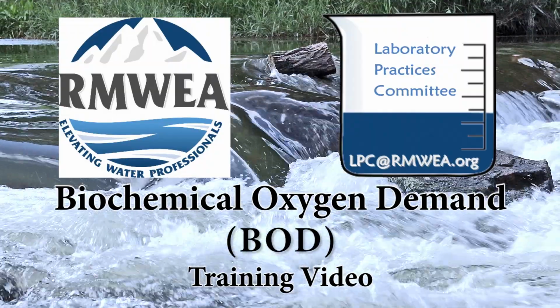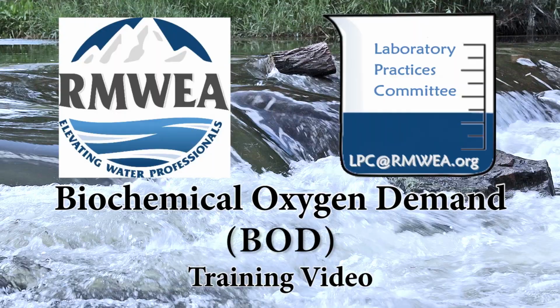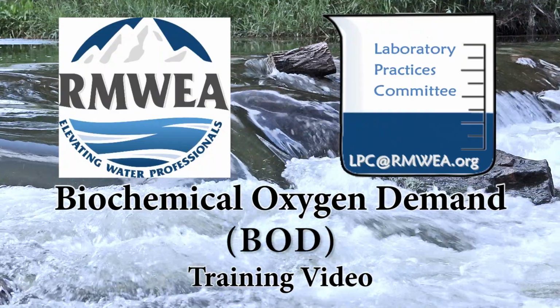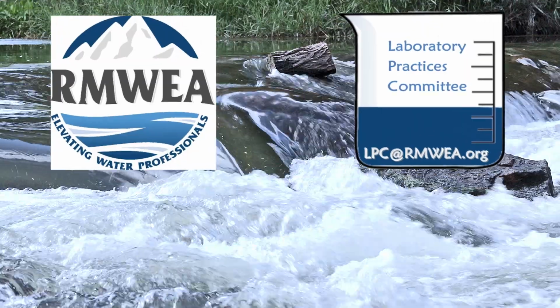Video for how to run biochemical oxygen demand, also known as BOD. The methods demonstrated in this video are adapted from Standard Methods in Water and Wastewater 23rd edition. However, if your permit requires a different method, you should follow the methods as specified in your permits.